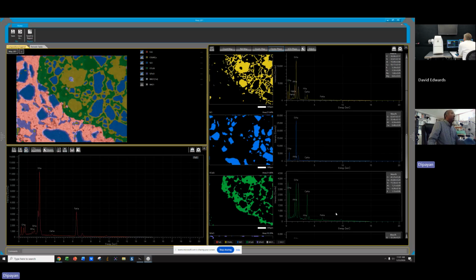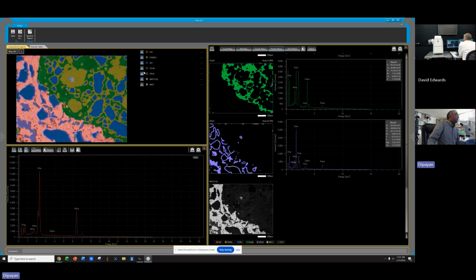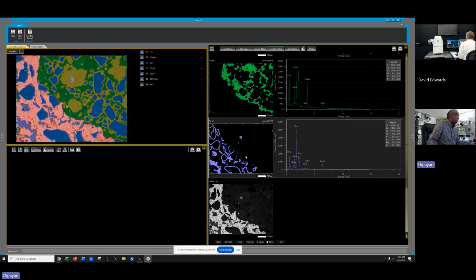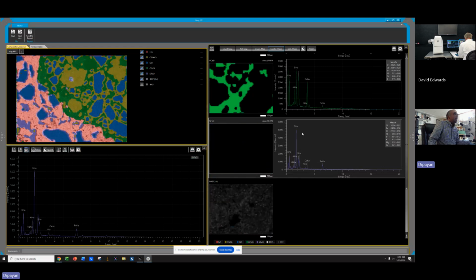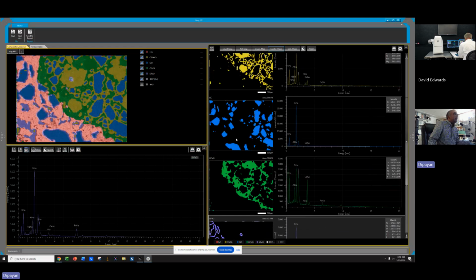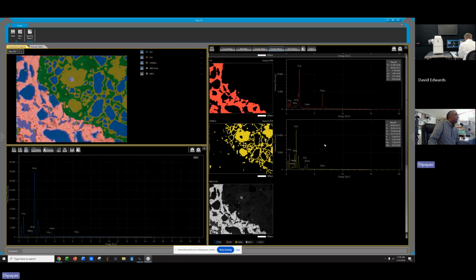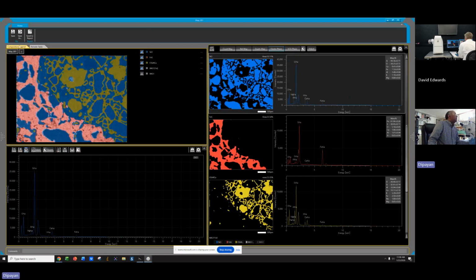Okay, so it doesn't matter wherever I am now. Okay, I can get rid of that. Again, if I get rid of that, I get the dark margin. I'd rather have this and this combined. And so now if I go to send to report, you don't want me to save here. I just straight go to report.